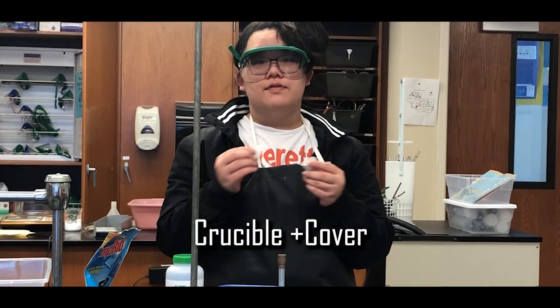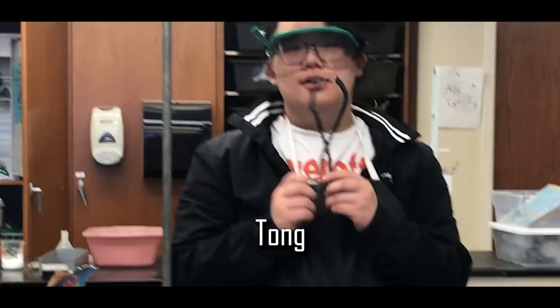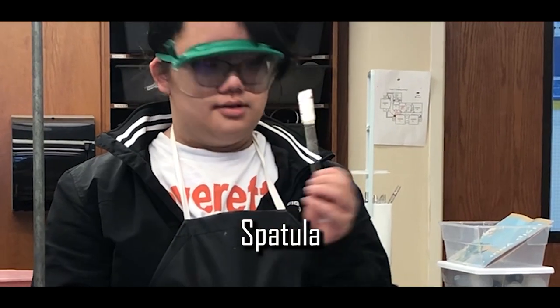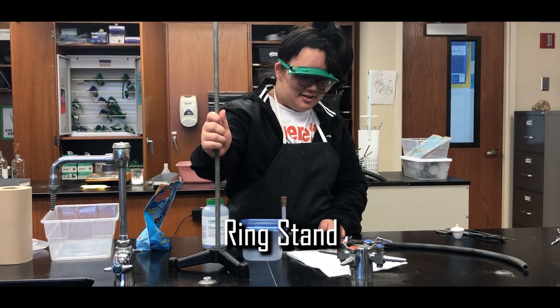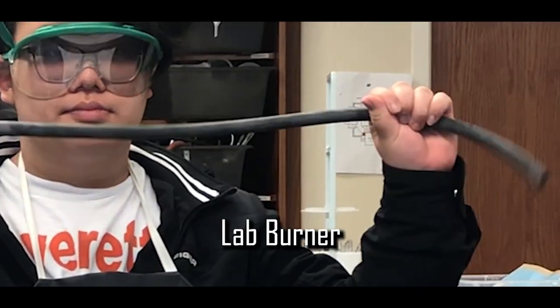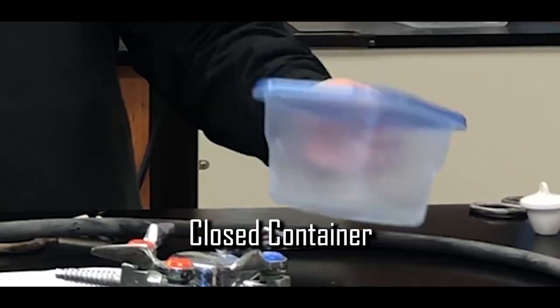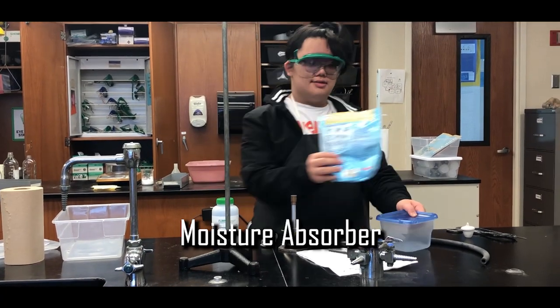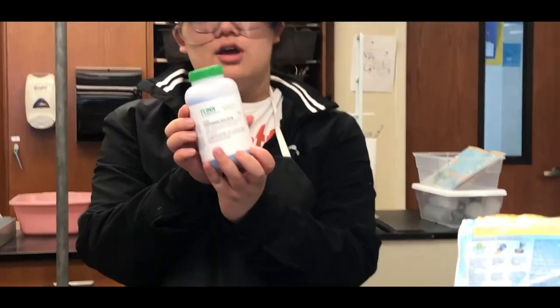The first step is to gather the following materials. The container and the moisture absorber will be used to make a desiccator. The copper-2-sulfate will be dehydrated.